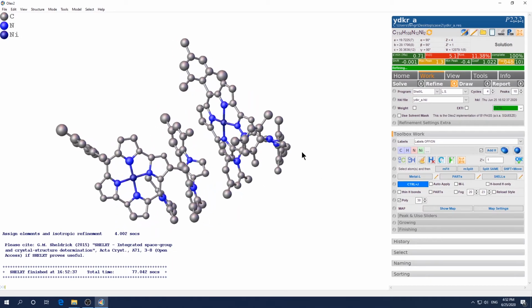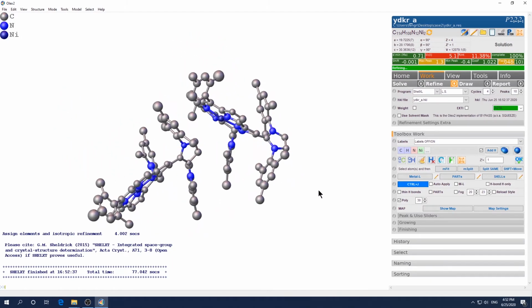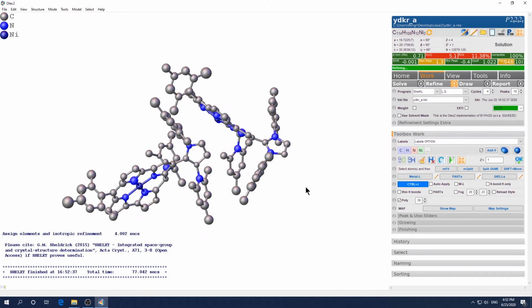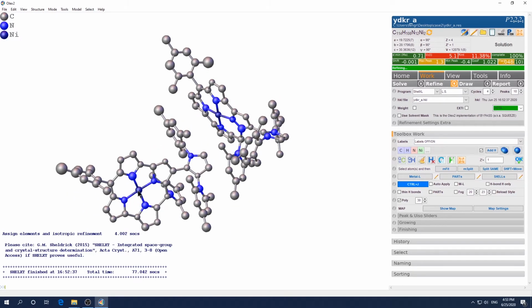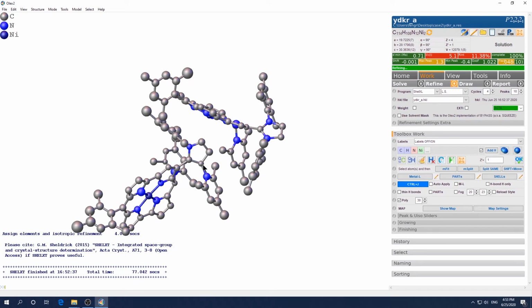With the reference structure in mind, we know what kind of structure we are looking for, and this doesn't look bad. See, there are only a few misassignments of atom type. For example, we know the central metal is nickel. We have 4 nitrogens coordinated with it. Then there is a ring here with 2 nitrogens. So this one should be nitrogen, but this was not.